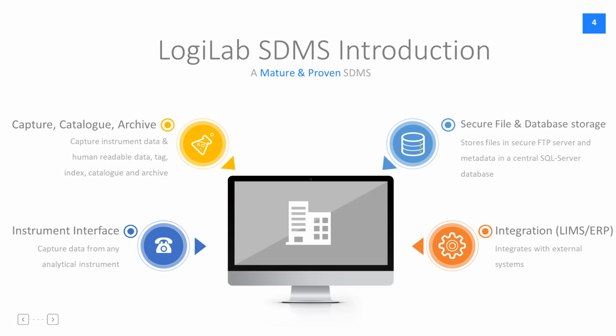LogiLab SDMS is a mature and proven scientific data management system. It has been designed mainly to capture, catalog, and archive instrument raw data and metadata, along with human readable data and tag data, in a manner such that the data can be indexed, cataloged and archived for long-term purposes.